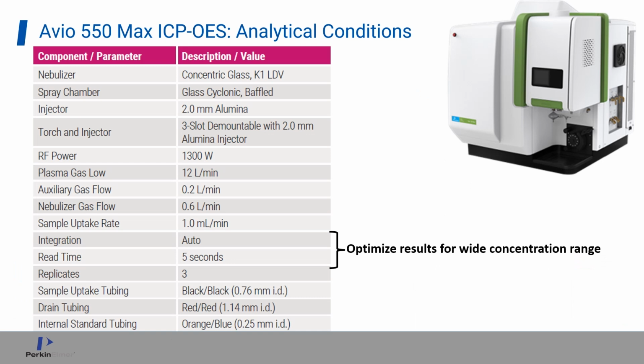We perform these analyses on an Avio 550 Max ICP-OES using a standard sample introduction system, as well as normal plasma conditions. We use auto-integration as well as a read time of 5 seconds.